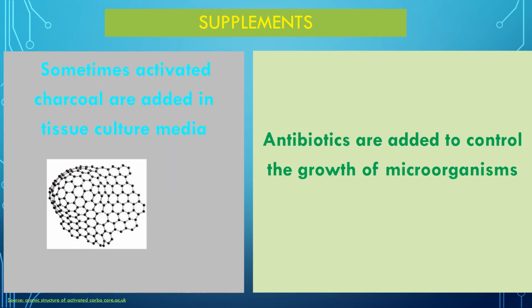Sometimes to promote growth, activated charcoal is added to the medium. This promotes the growth by adsorbing some inhibitory components like phenols. These phenols are released by the growing cells themselves. In addition to this, sometimes antibiotics may be added to the medium to control the growth of microorganisms.